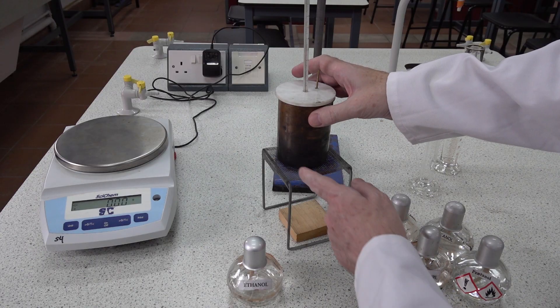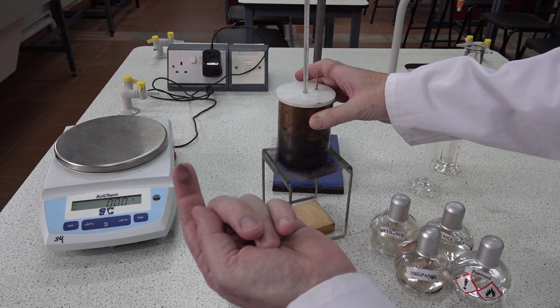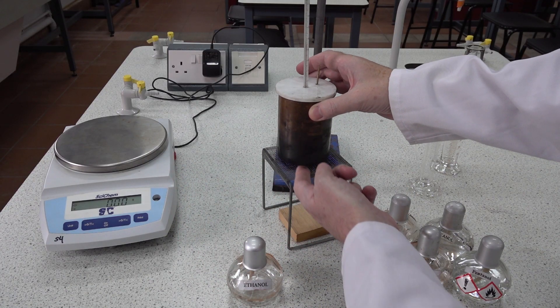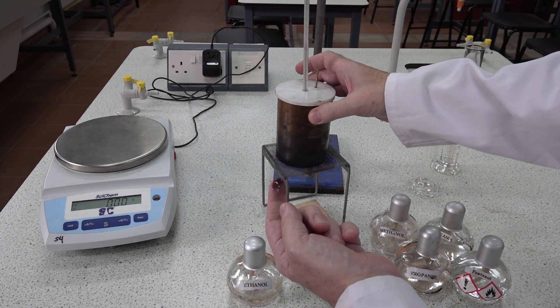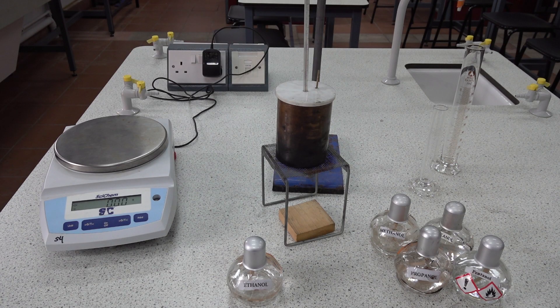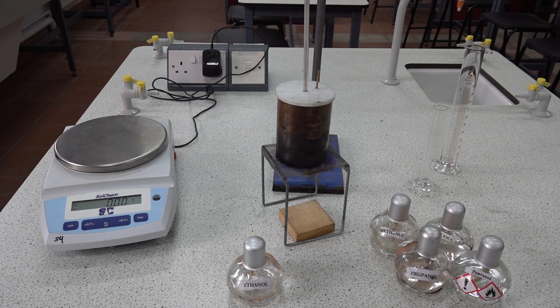Another easily identifiable error is the soot — carbon from incomplete combustion — and there seems to be rather a lot of it in this experiment. We can see that the ethanol does not burn completely, so we will not get a maximum reading for the enthalpy of combustion of the ethanol.